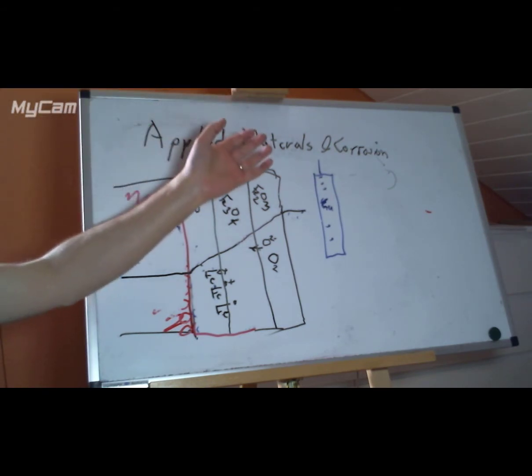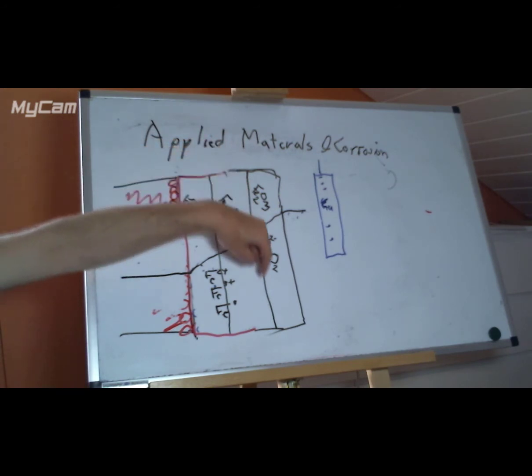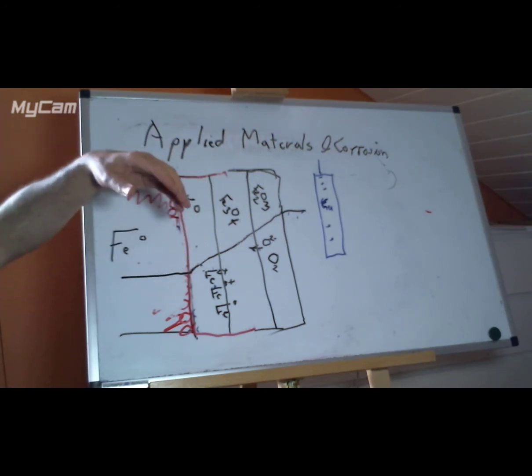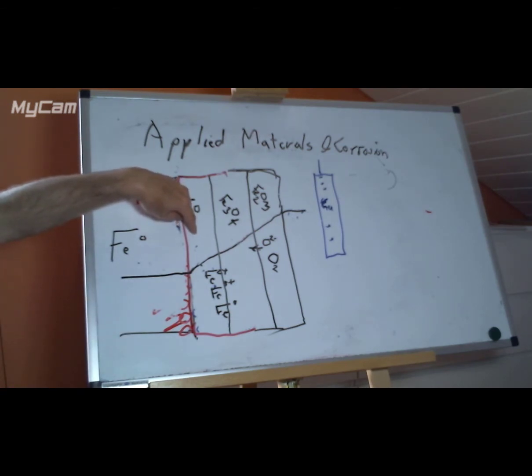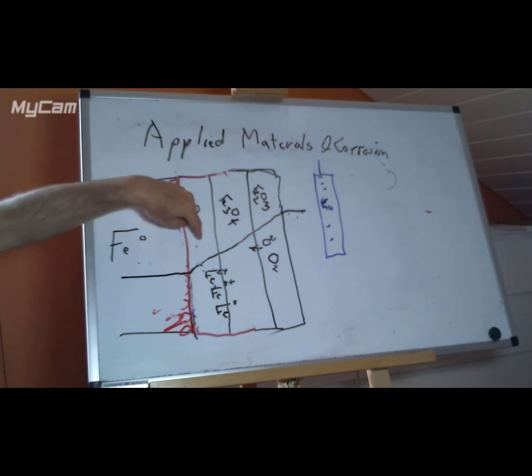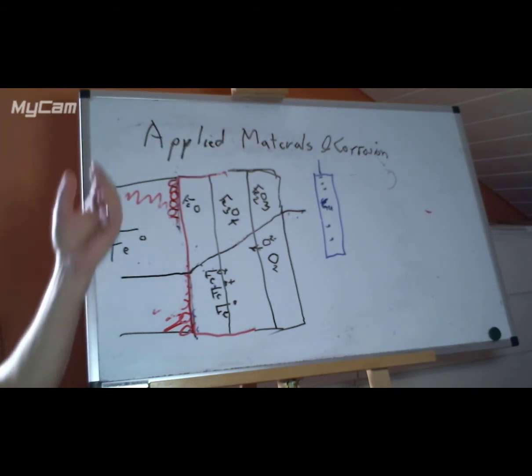So some of these do have borders, some of them don't. In iron, there are a lot of oxides, and so some of the interfaces are smooth. There's a wide transition, and some of the others are not. But we then see a complex oxide structure, and the iron oxide here, for example, is held at this iron(II) state because of the oxidation potential at this position, because the iron is reducing it and the oxygen is oxidizing it, and so it happens to be balanced for that.